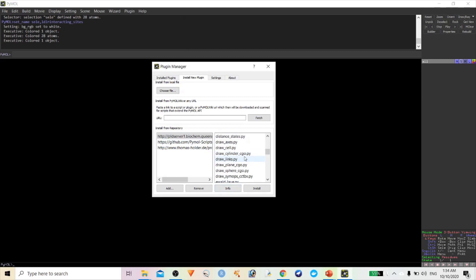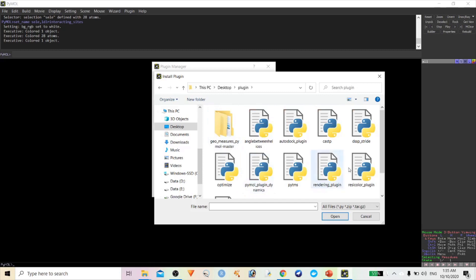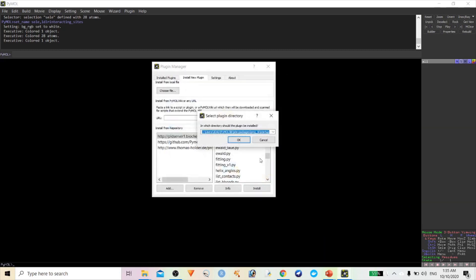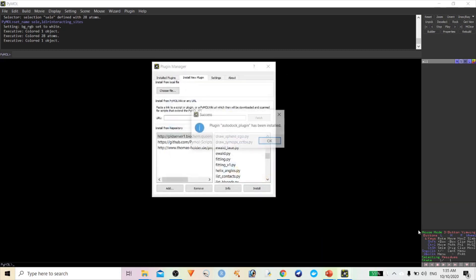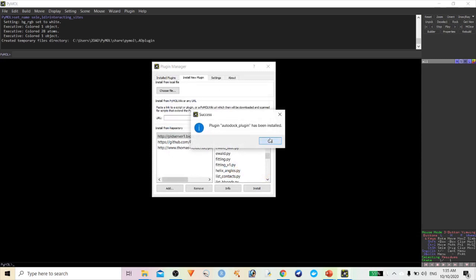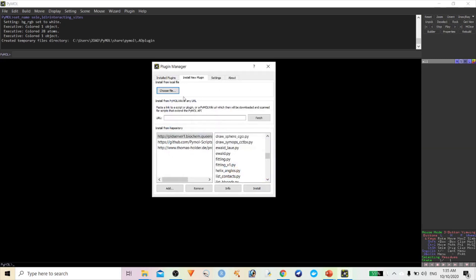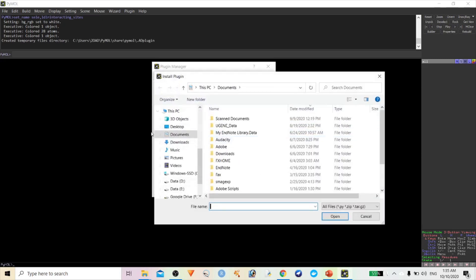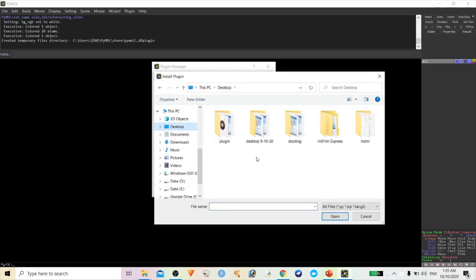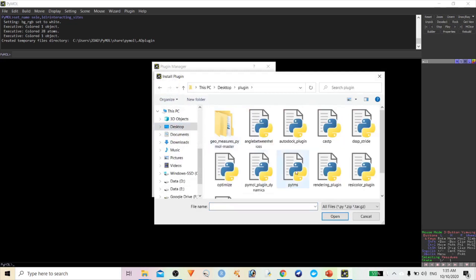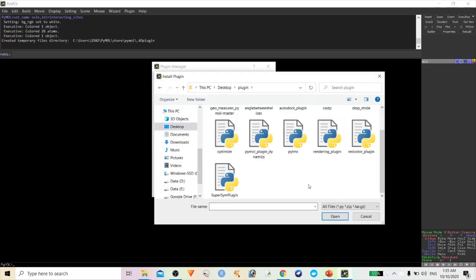If you want to install from external sources, some plugins you won't find in the manager, so install from external. For example, the AutoDock plugin is available — I'll install AutoDock plugin. I'm going to install a few more plugins, like CastP.